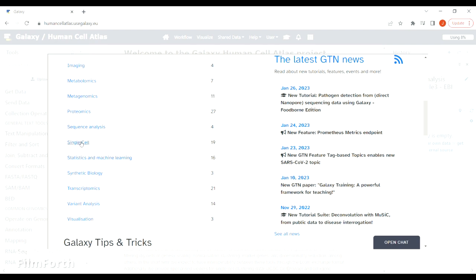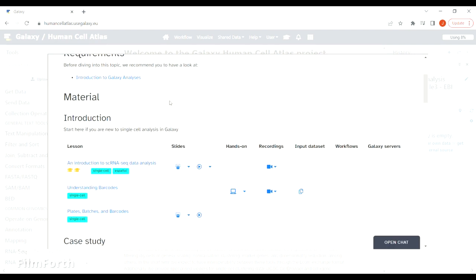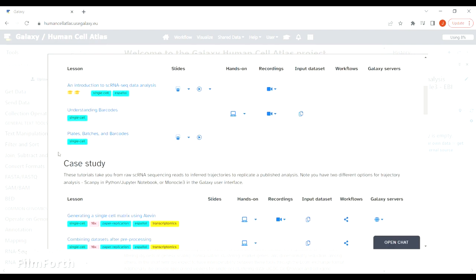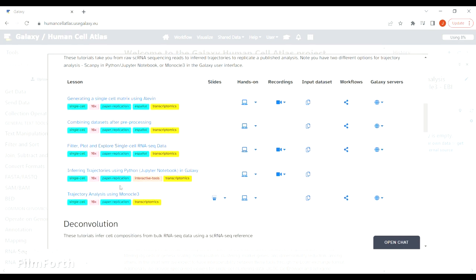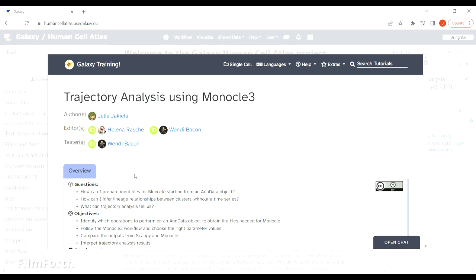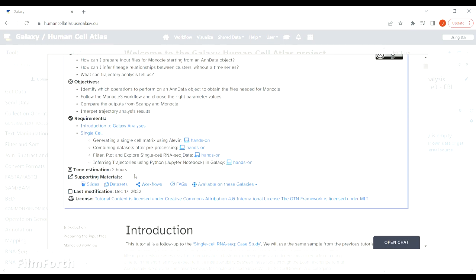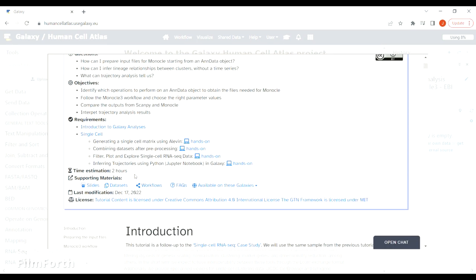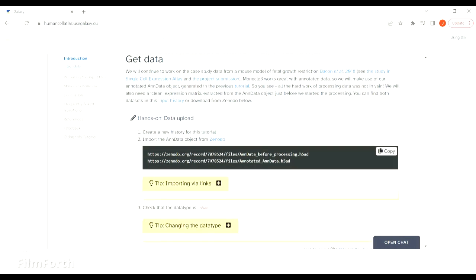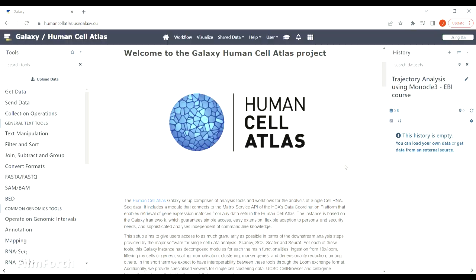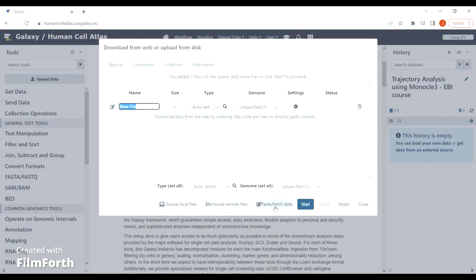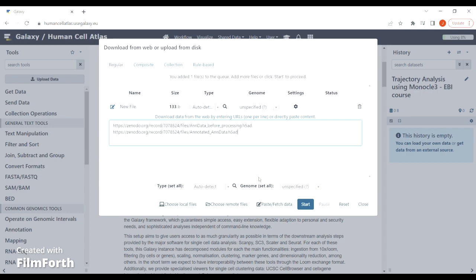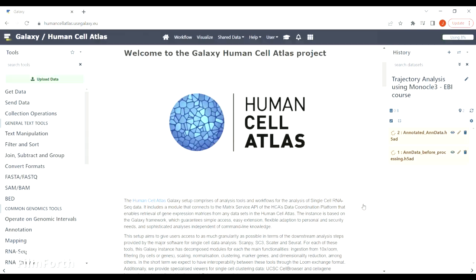We will be using data from a case study series. You can click on the tutorial and follow the instructions. The easiest way to get the data is to copy those two lines, go to upload data, click here, paste it, then close the window and wait until your files are loaded.